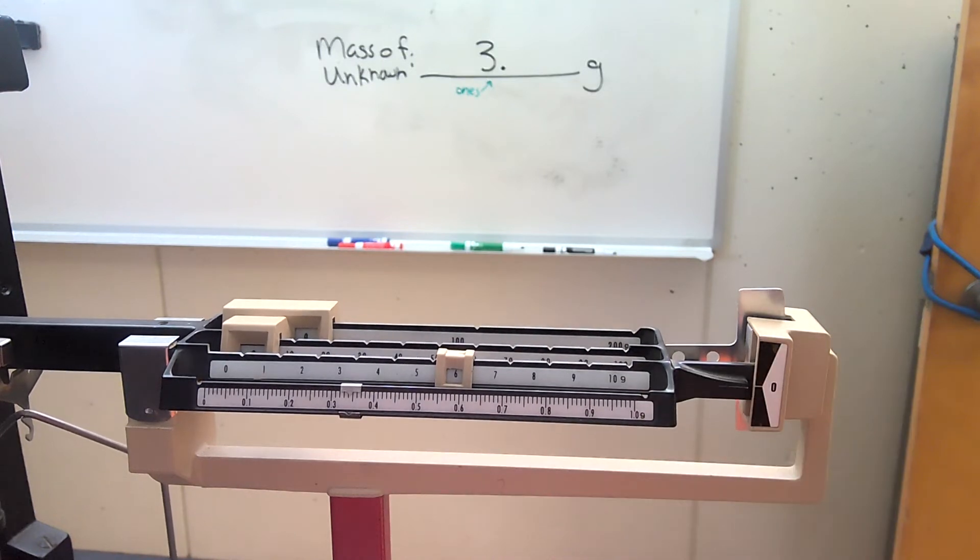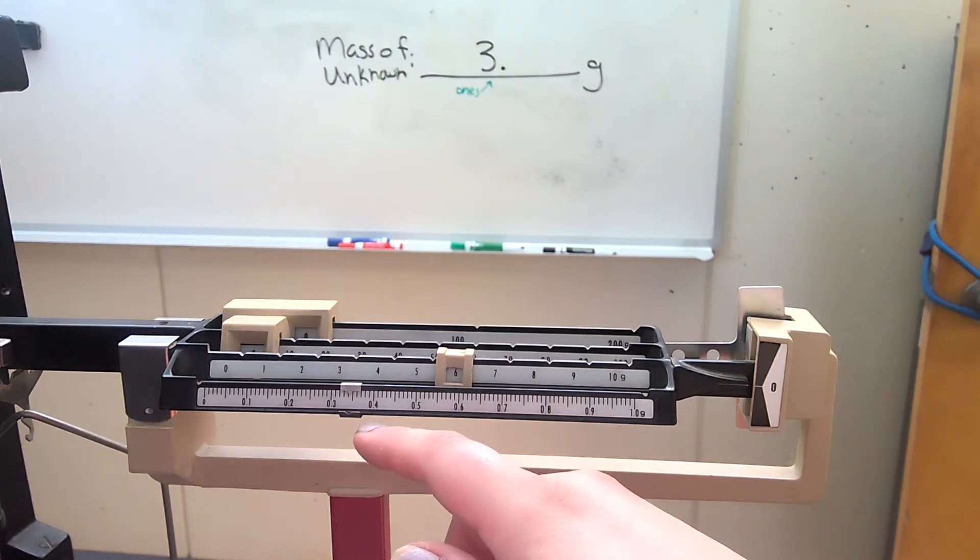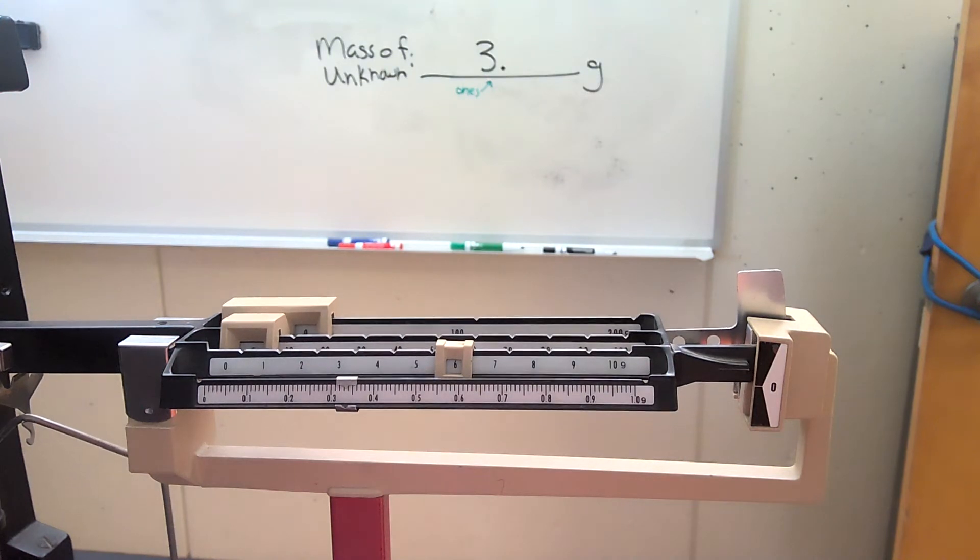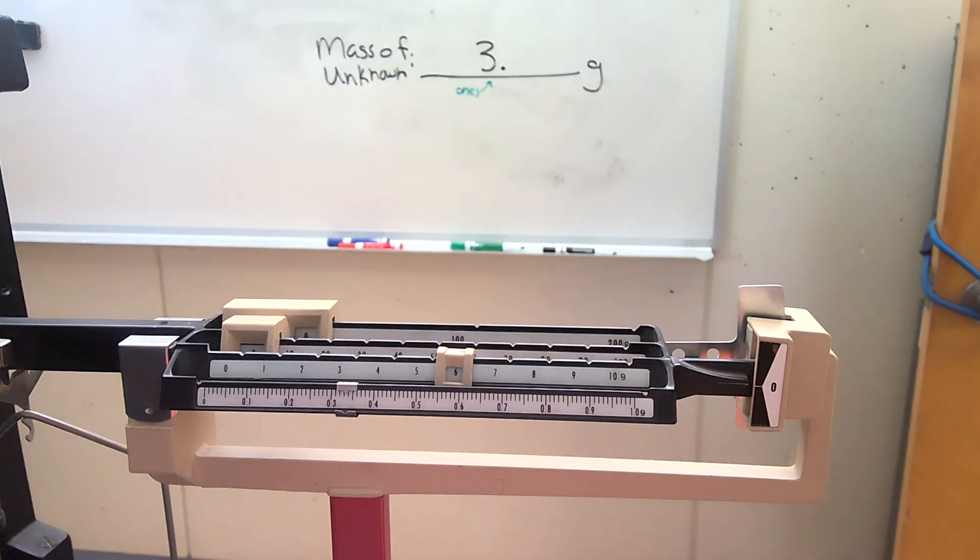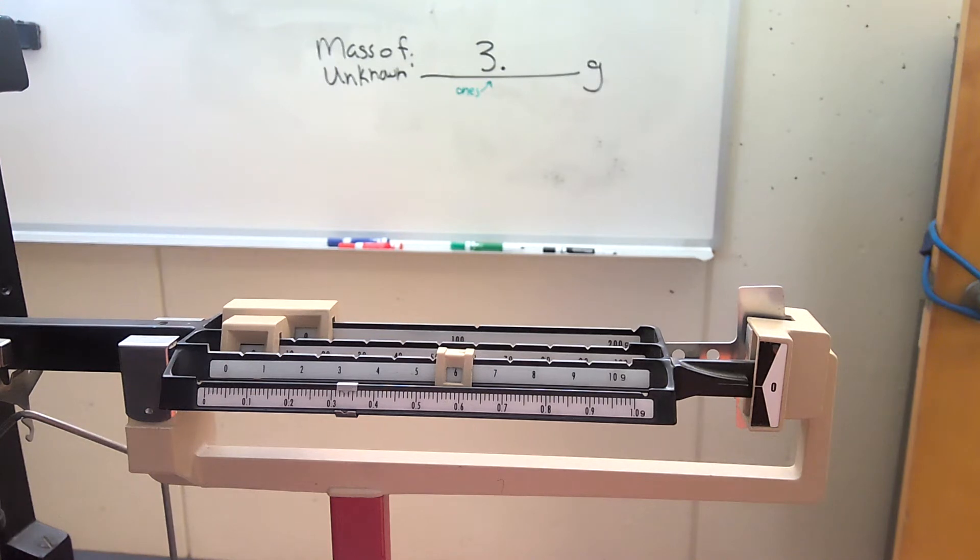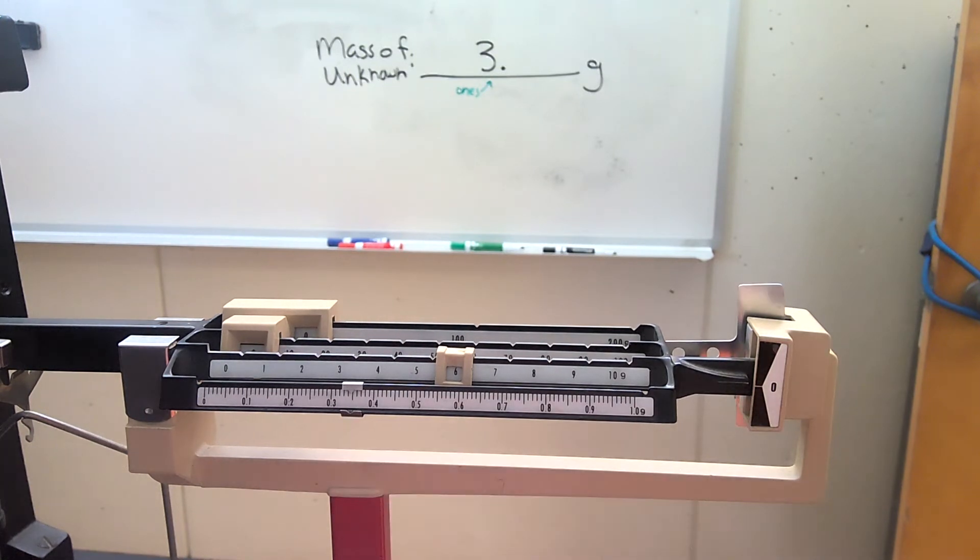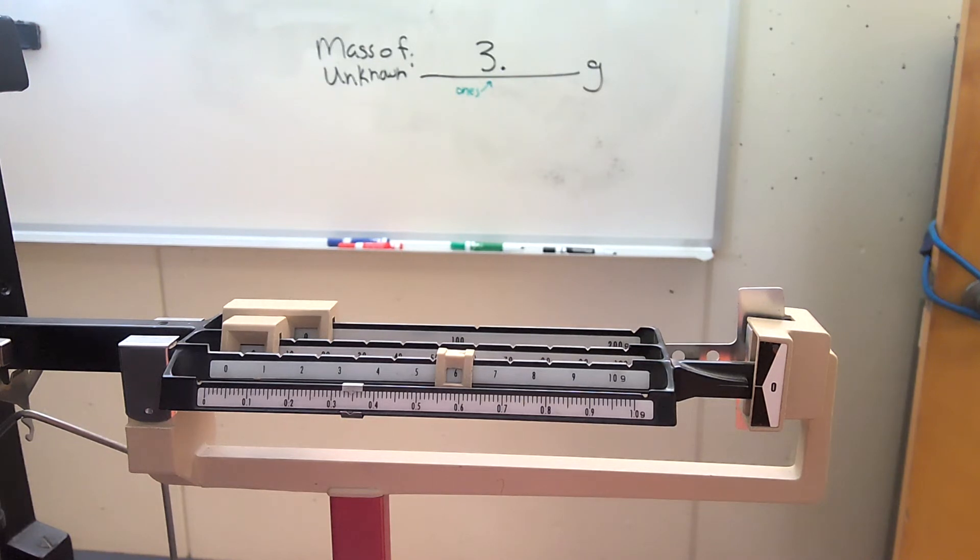So let's go back towards point three. It's looking a little bit closer to zero, but it looks like it's not quite on there yet. So I'm just going to smidge it over just a little bit. So it's a little bit past zero now, so just a little tap. See if that does anything. And this is what I was saying earlier about this part being the patient part. Laying it even out.